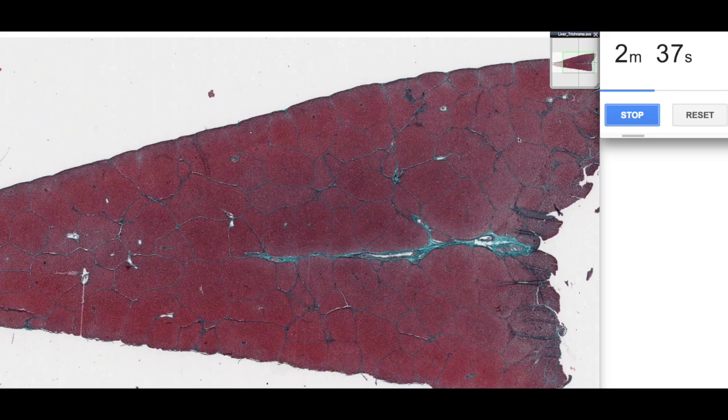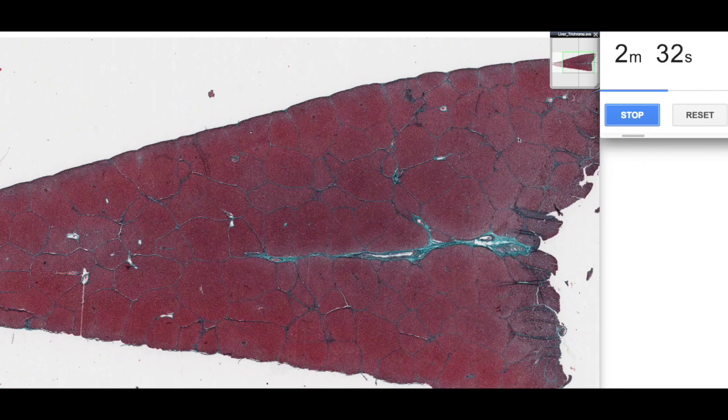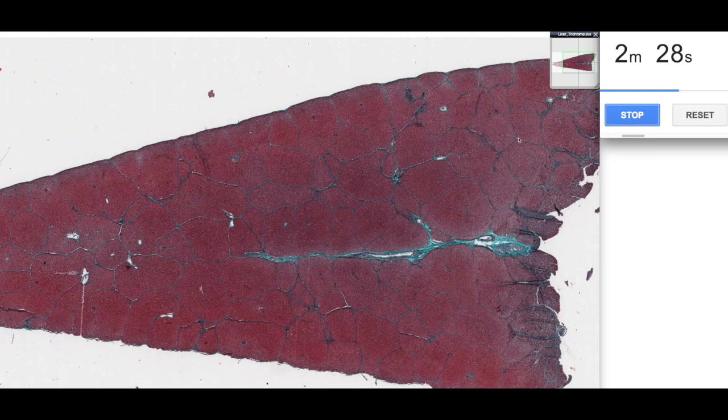And this is a section of the pig liver and we classically use this in histology because they have very well-defined lobules. So a liver is made up of lobes and then those lobes are further subdivided by connective tissue into lobules.